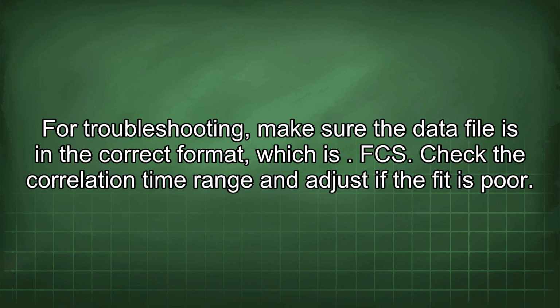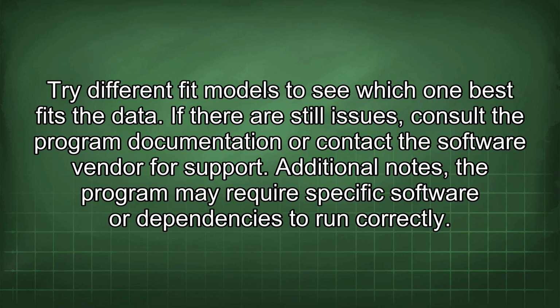Check the correlation time range and adjust if the fit is poor. Try different fit models to see which one best fits the data. If there are still issues, consult the program documentation or contact the software vendor for support.